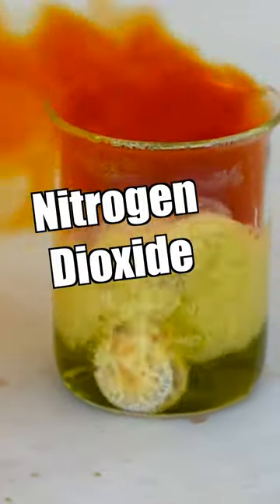The orange gas coming off of this is nitrogen dioxide, and you definitely don't want to get it in your mouth or eyes. It can combine with the moisture and turn back into nitric acid.